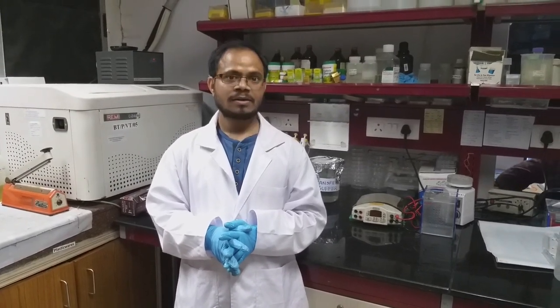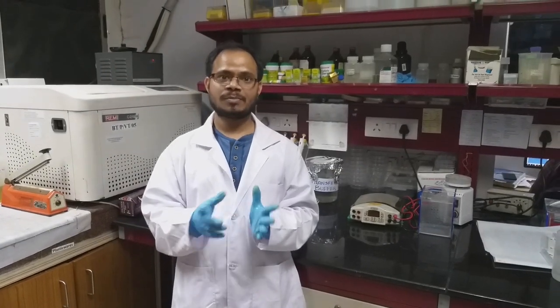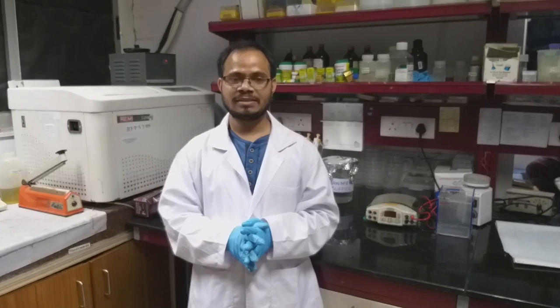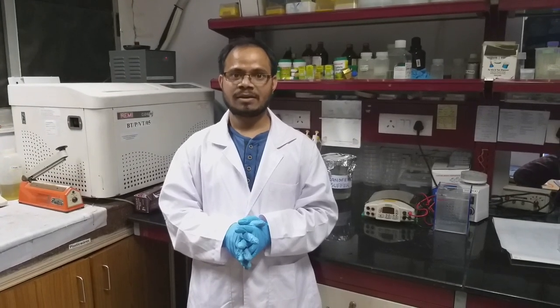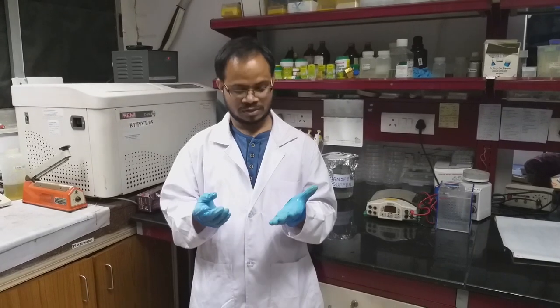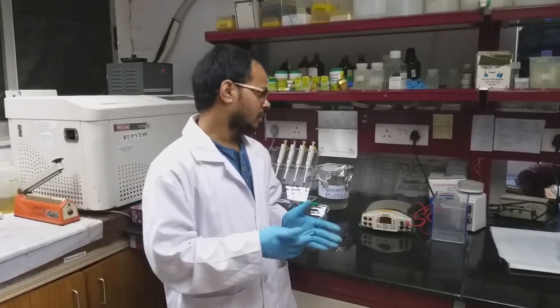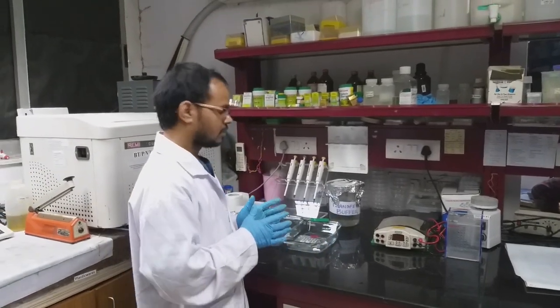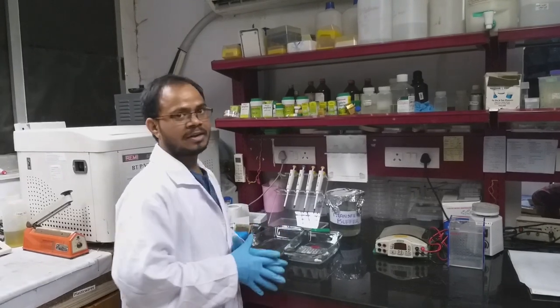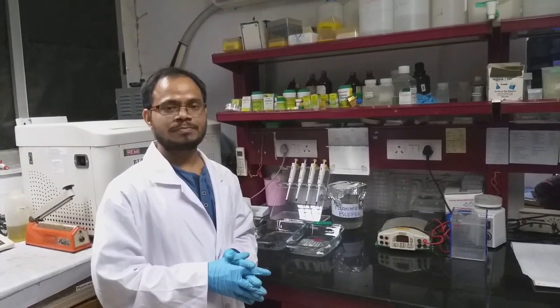Apart from that, while handling the instrument, there may be a possibility of electric shock sometimes. So at that time also we need to use gloves. And after finishing the transfer, you have to clean all the apparatus properly and dry it for the next use.